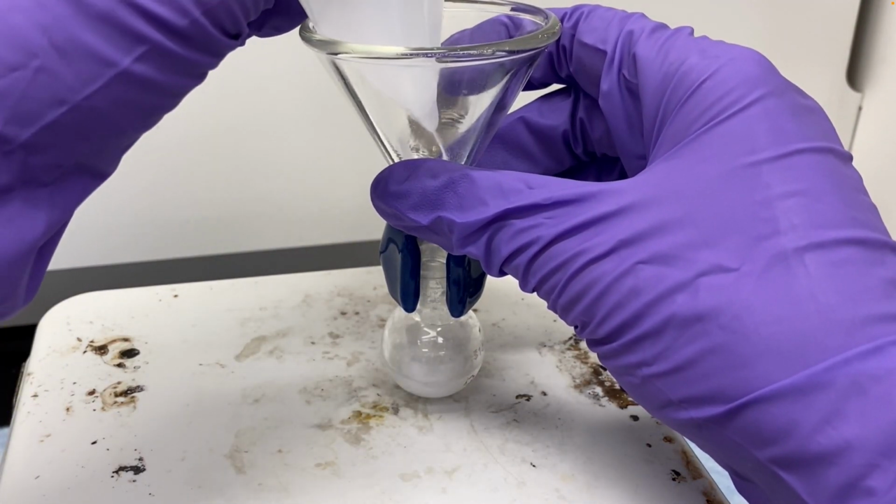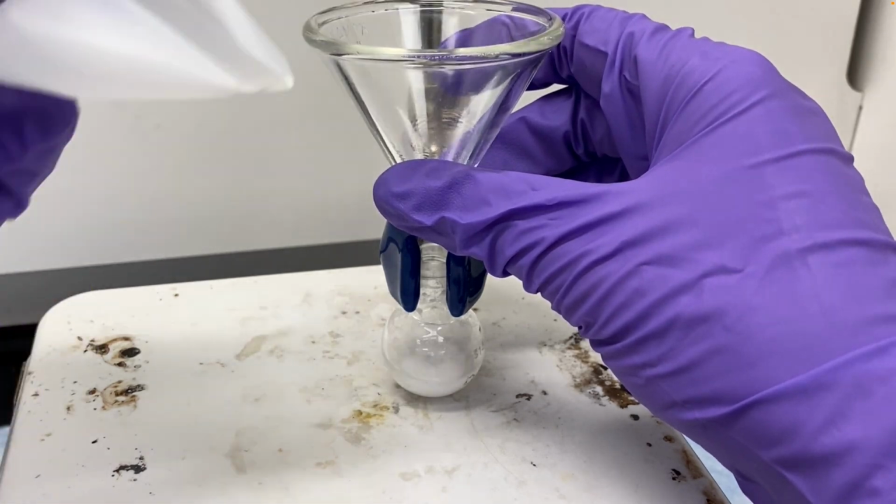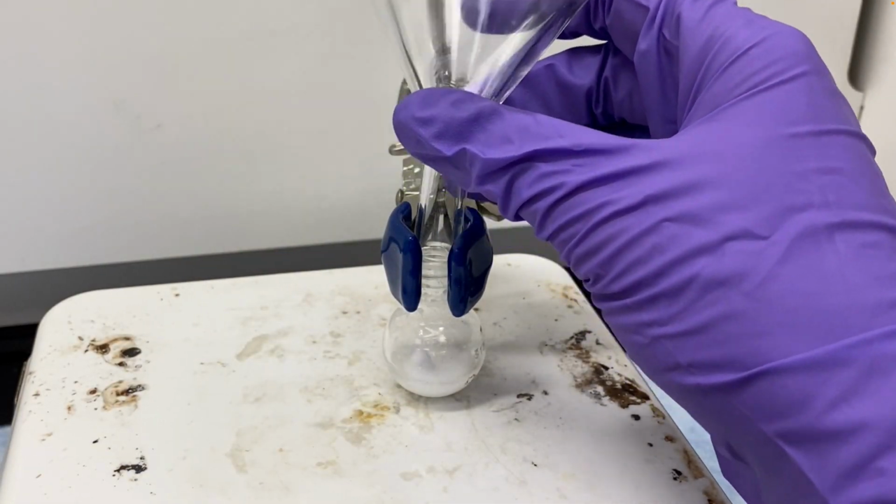Notice we're using a powder funnel with a thick neck. We're bending the weighing boat so that it turns into a sort of spout.